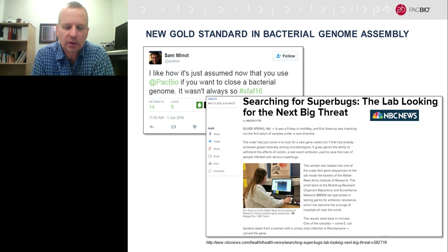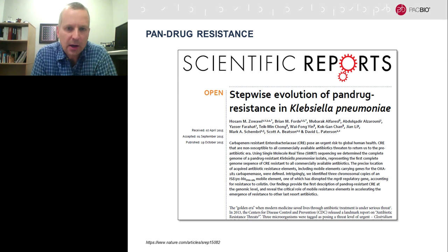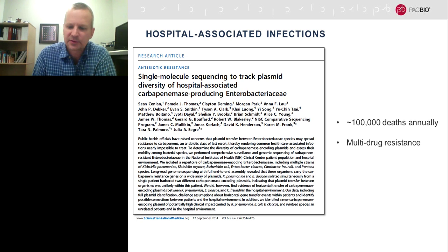Here was an NBC News article from a while back where researchers at Walter Reed Institute over the weekend sequenced the complete genetic blueprint of one of these dangerous bacteria. And that has led to publications like these where it is now possible for the first time to really understand the evolution and generation of some of these very dangerous superbugs that are resistant to all known antibiotics. So this is a Klebsiella.